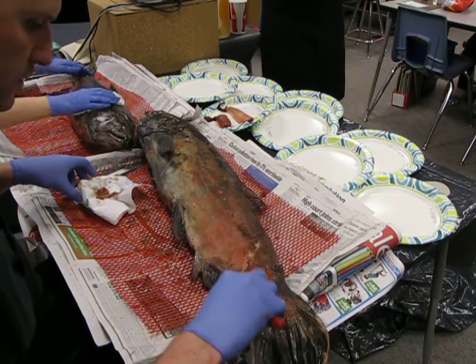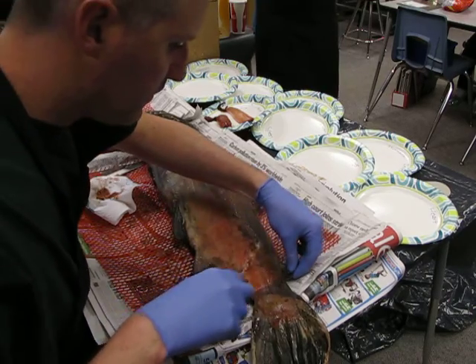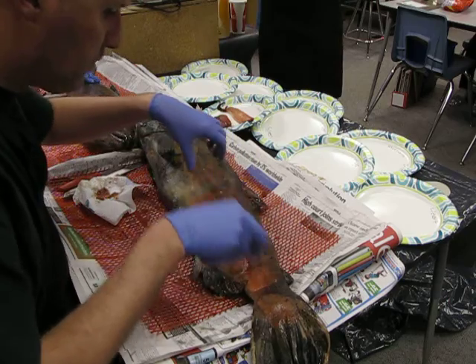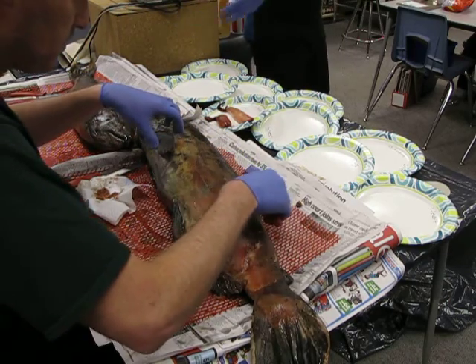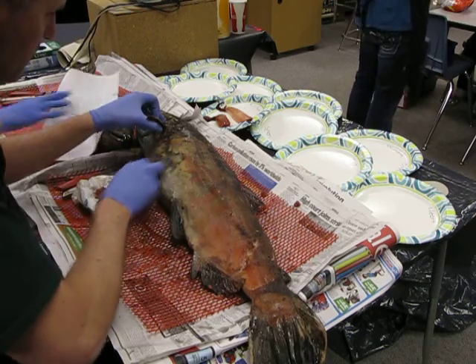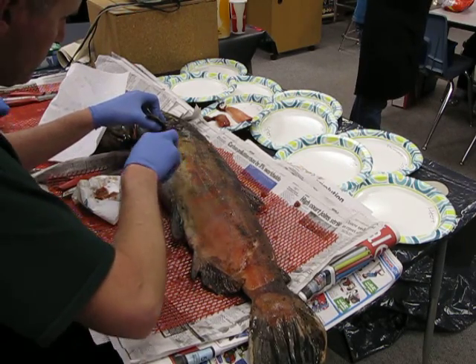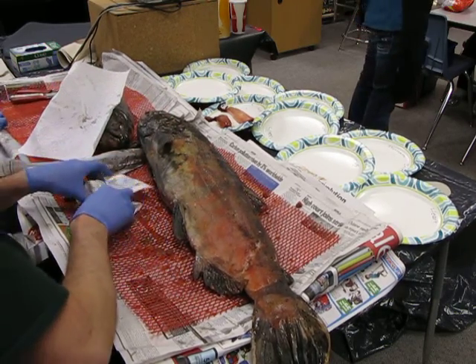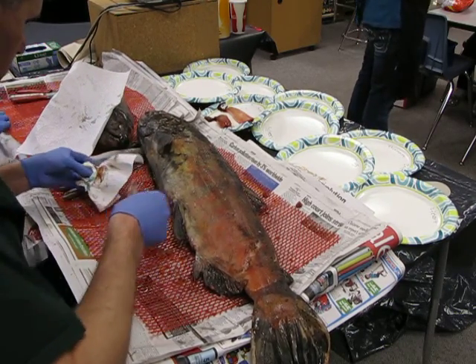All right. So these salmon here, they're Chinook salmon. We have 2 of them, and hopefully we have one male and one female. We will see. What these guys are starting to do first is wipe them off. Now these Chinook salmon are fall spawners. So they're in the spawning stage when they died. They've been frozen since October, for a long time.